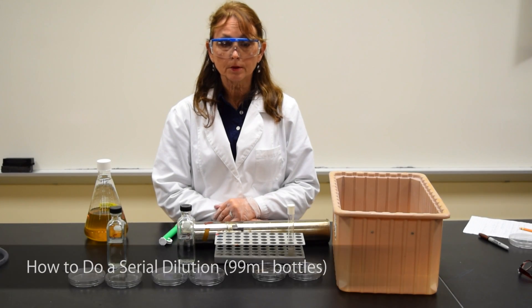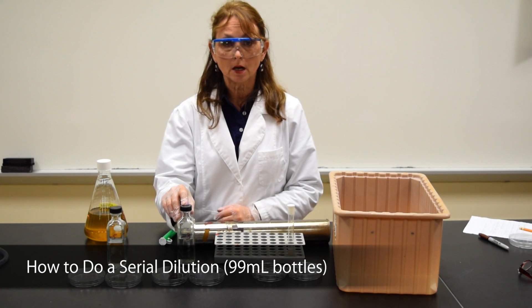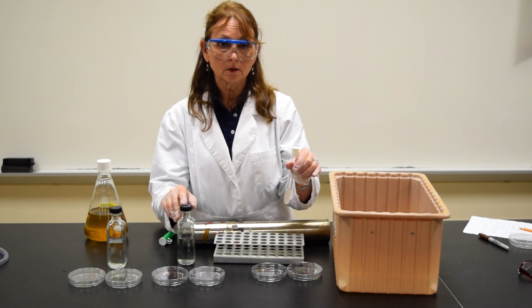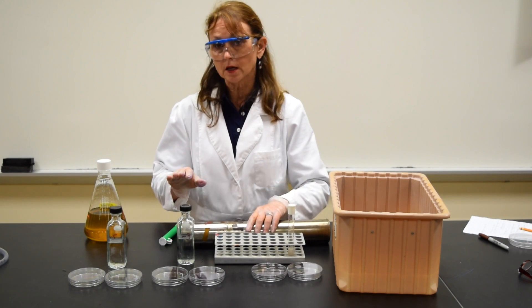This demonstration is to show you how to prepare serial dilutions using 99 ml water bottles. In this case, I'm going to be starting with my turkey sample. It's already prepared and it's at a 10 to the minus 1 dilution. I have my plates and my bottles labeled and ready to go.